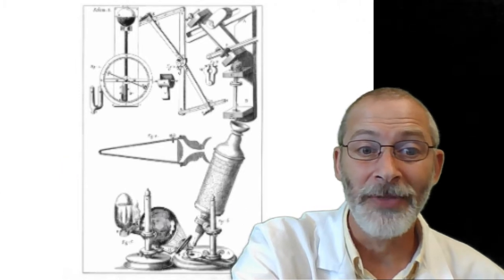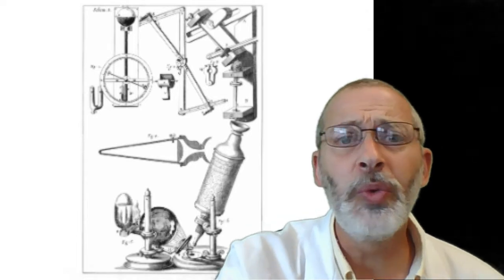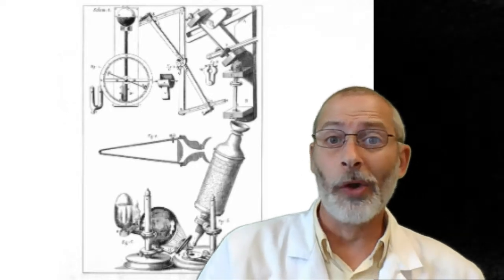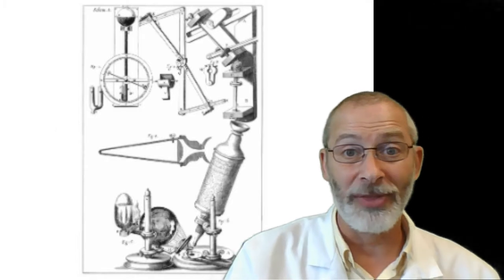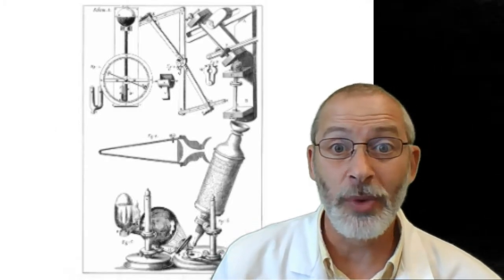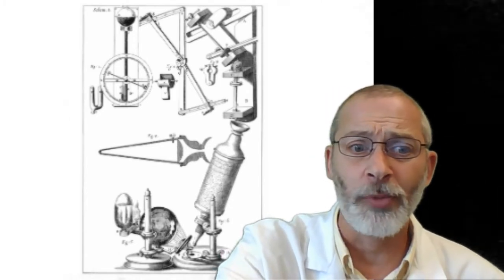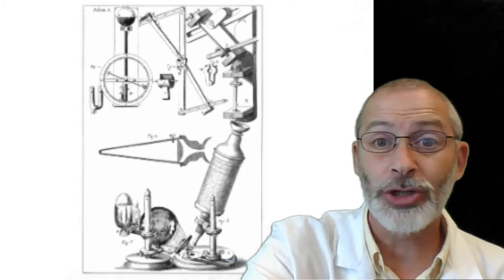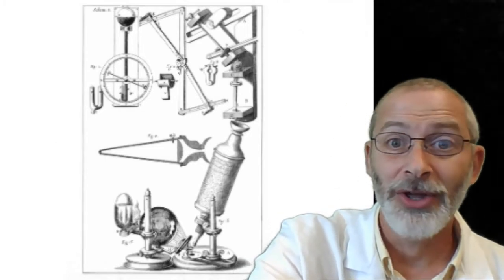It's really cool. But microscopes open up a whole new world of things that are not seen with the ordinary unaided eyeball. We can see a lot of stuff with our eye, but the microscopic world is that much cooler because we can't see it without a tool called a microscope. Now, some microscopes are more powerful than others, and some of the most powerful microscopes, the electron microscopes, we won't be using in school because they're like millions of dollars, although it would be cool.